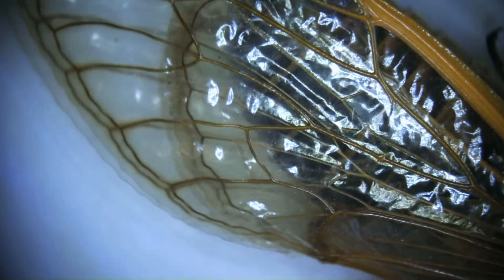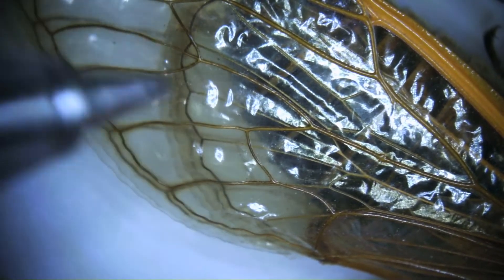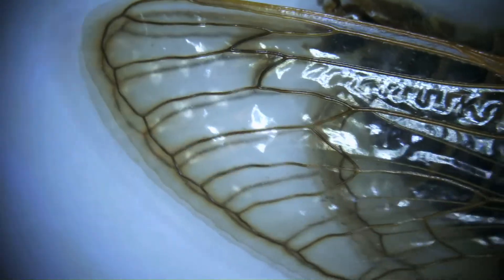Here we've got the wings, and in a cicada we have four wings — the big ones out front. Then underneath you can kind of see that opaque area; it's a little translucent, but where it gets more opaque is the hind wing that's underneath the forewing.